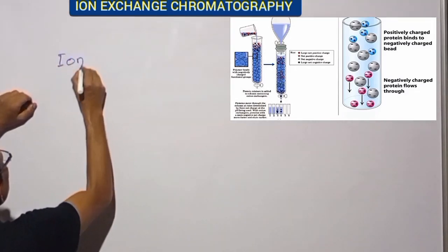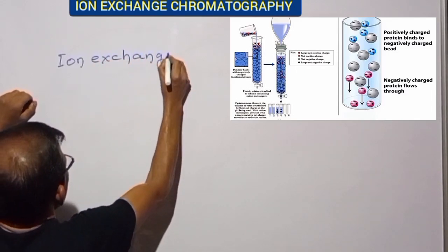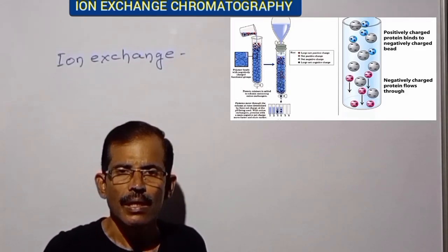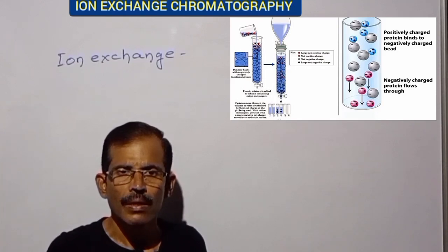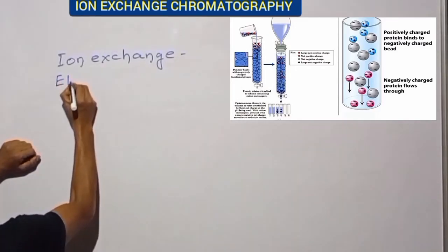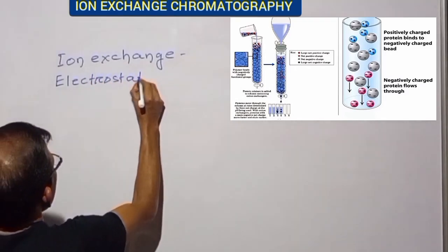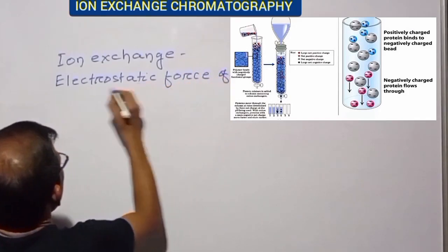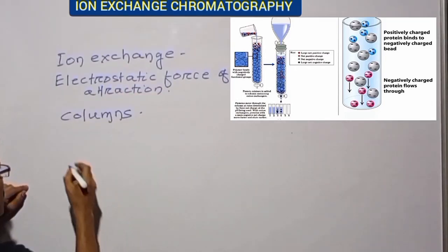Ion exchange can be defined as the reversible exchange of ions in a solution with ions that are electrostatically bound to an inert support medium. The governing force in ion exchange reactions is the electrostatic force of attraction.